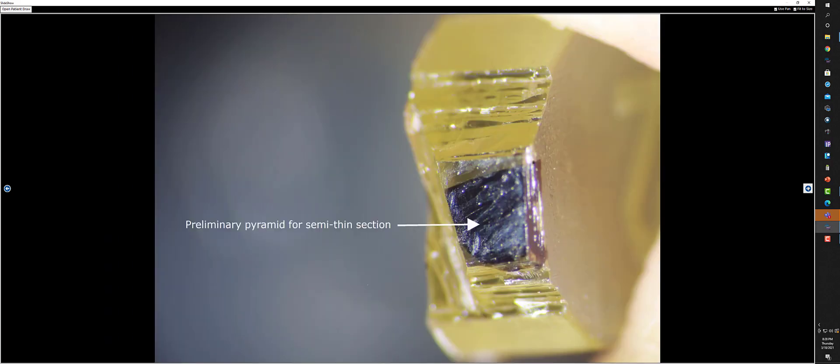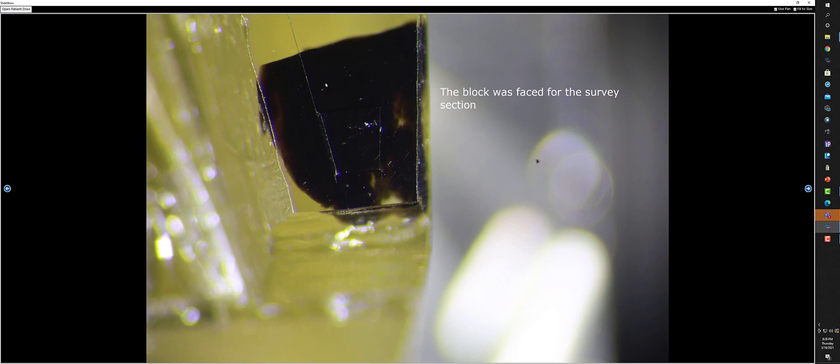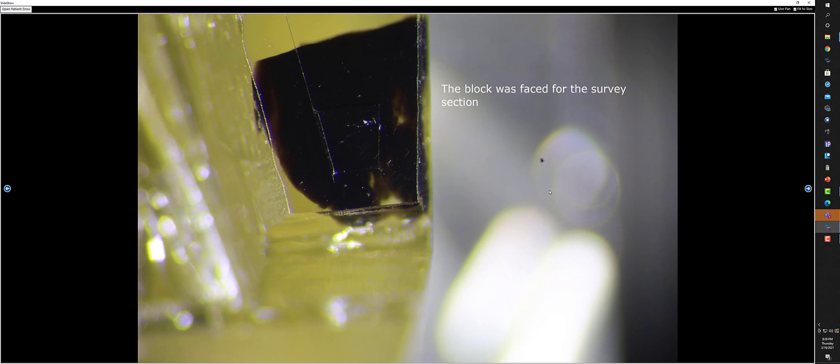This is the preliminary pyramid in preparation for doing a survey section. And then you face the block, which is making this very flat, and you can see that the pyramid encompasses most of the specimen. Now we're going to take some thicker sections to do a survey because the actual area that you can examine is much smaller than this.